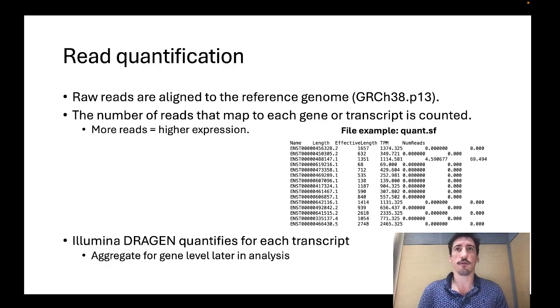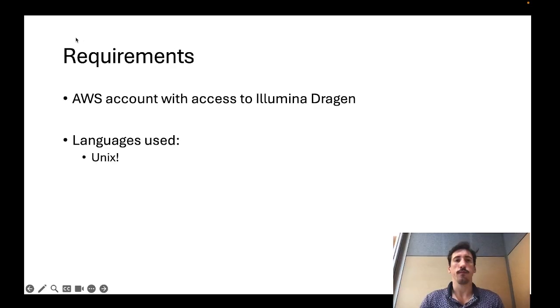So now that we've covered the basics of RNA-Seq sample prep, raw output, and quantification, next I wanted to show you how we're going to obtain this reference genome, and then we'll jump into the actual steps that are required to perform quantification using Illumina DRAGEN.